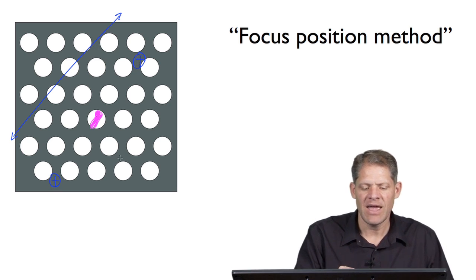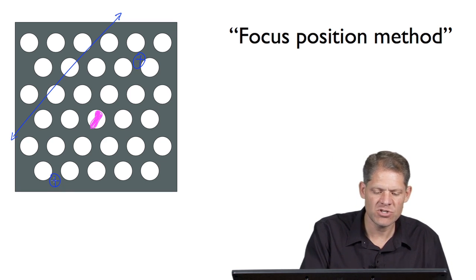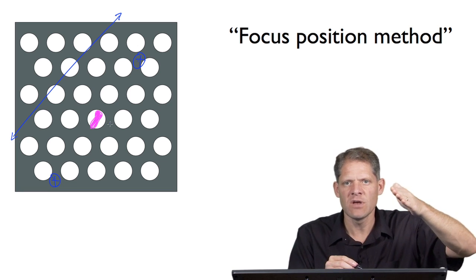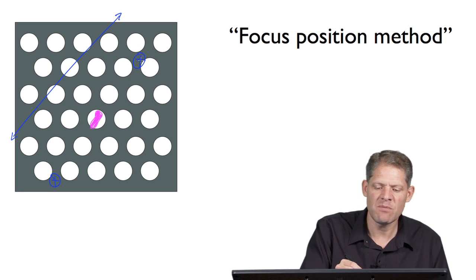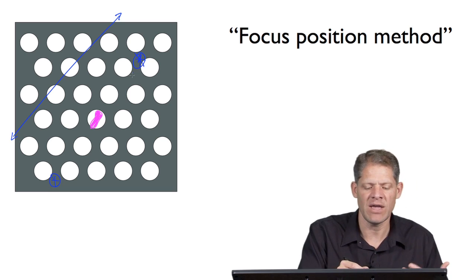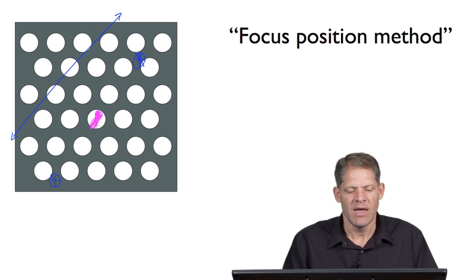And because of that, as the grid tilts back and forth, these positions should always stay at the same height as the specimen itself. And if the grid moves up or back, these should be moving to the left or to the right and up and down in the same way that the target is moving left and right and up and down.